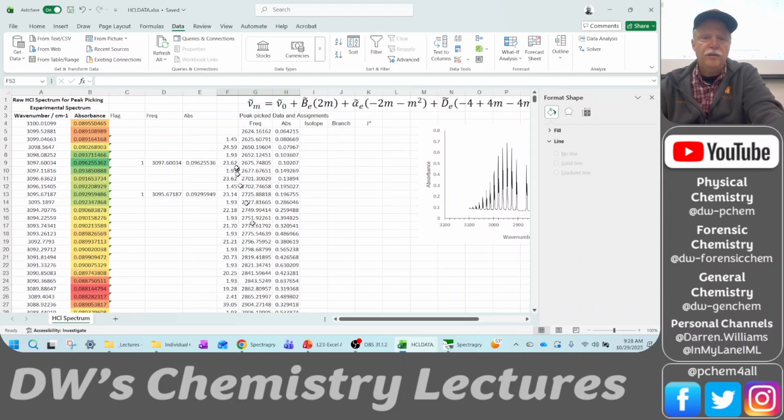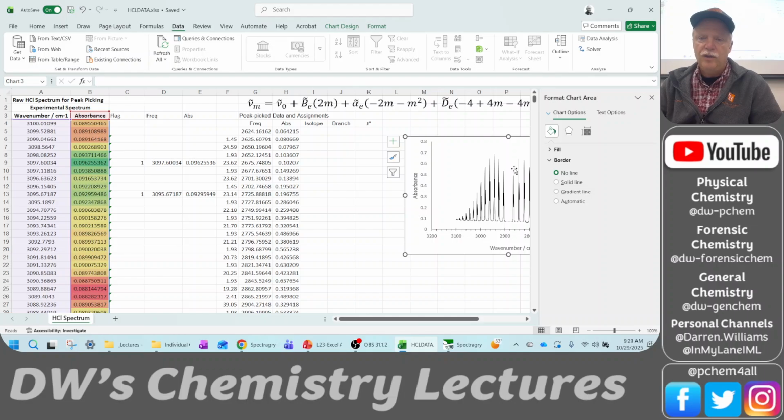Okay, so there's our peak frequencies and intensities. Okay, now we can plot these things. We can figure out what isotope they are and all of that. But let's go to the middle of the spectrum and start with the R0 line. So let's find that R0 line. It's real close to 2900. So it should be around 2904. That makes sense? So let's start with R0, 2904.